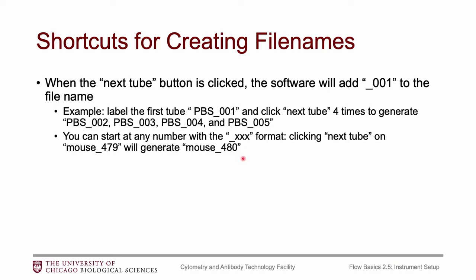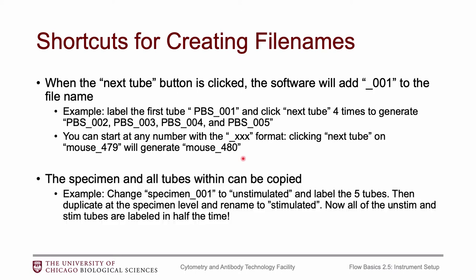The second trick has to do with groups. If you have two sets of samples where the tubes are labeled exactly the same but one set is unstimulated and the other is stimulated, use the specimen as a group. Change the specimen name to unstimulated, create all the tubes within that group, label all five tubes, then right-click on the unstimulated specimen and duplicate it. Change the duplicate's specimen name to stimulated. Now you have two groups with the same tube labels without typing everything twice.